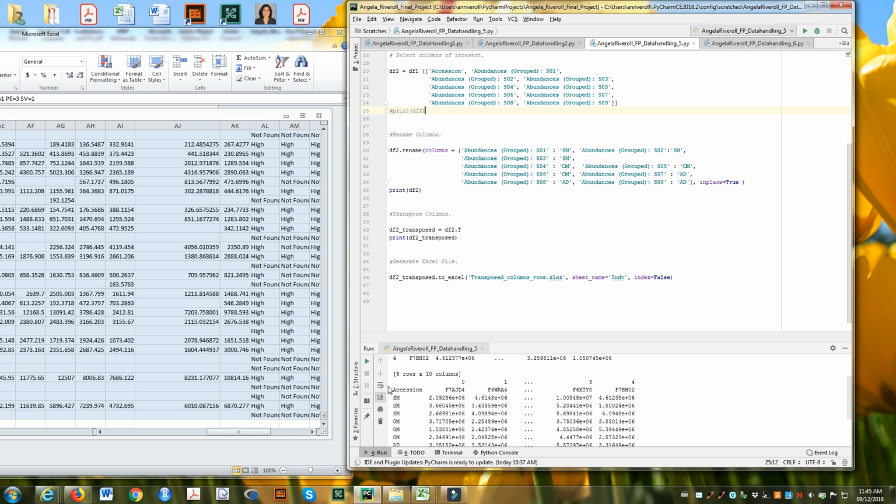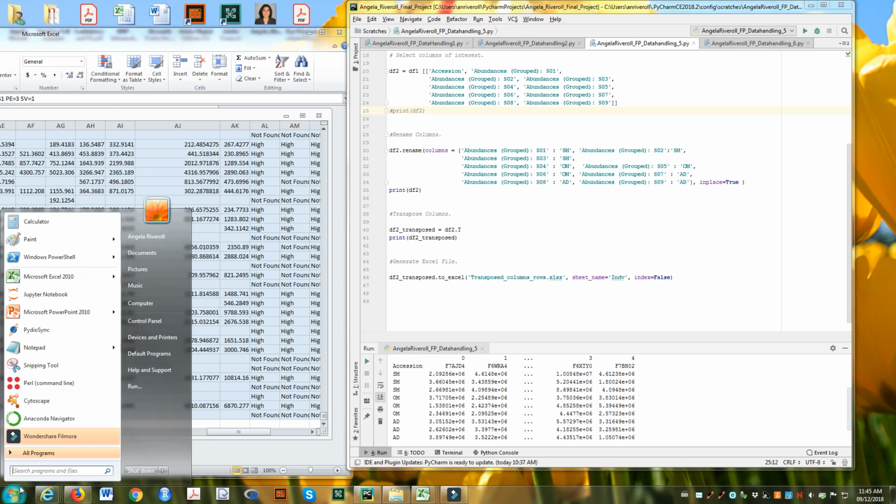For example, this was generated as a name and these as objects, so it made things complicated to get the table in a format that could be recognized by the next scripts. So I ended up exporting it to Excel, and then I made a minor modification, removing these indices in Excel.